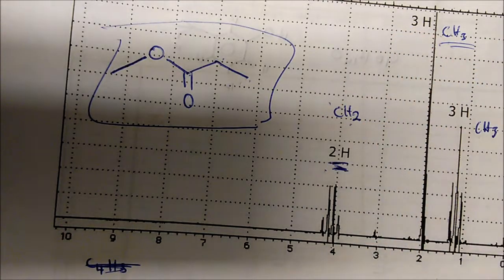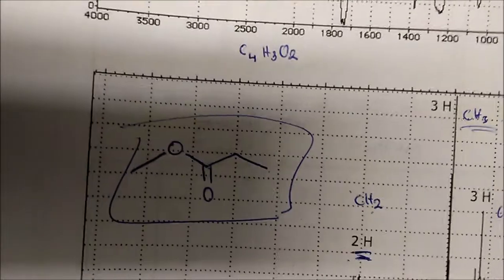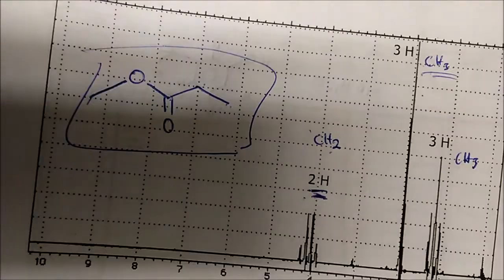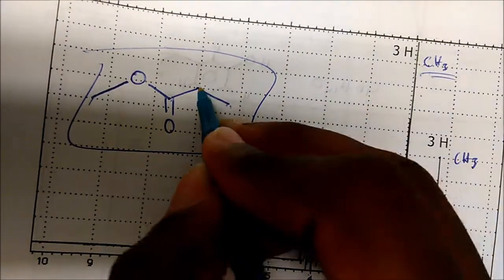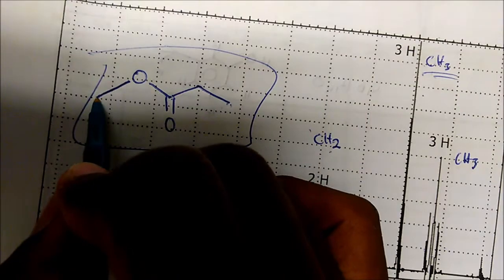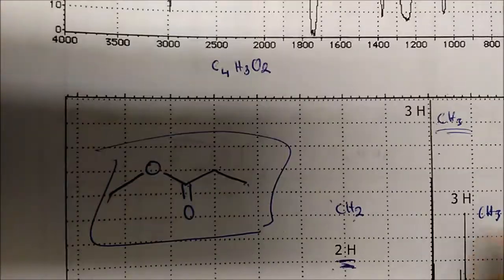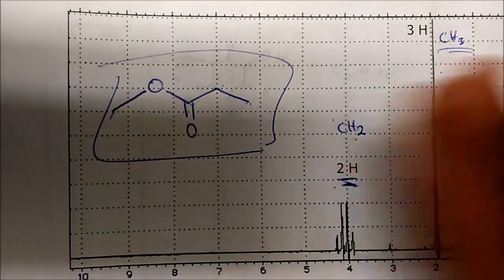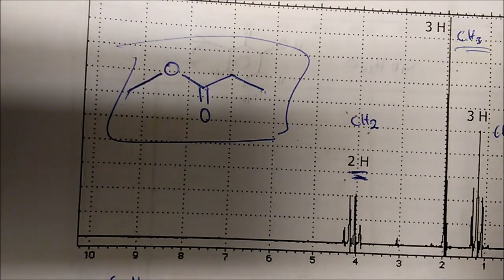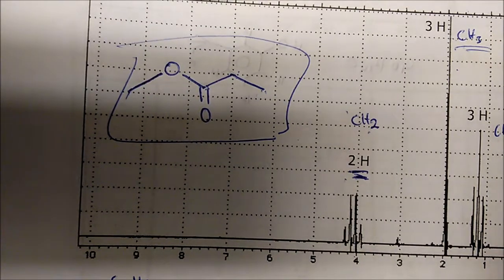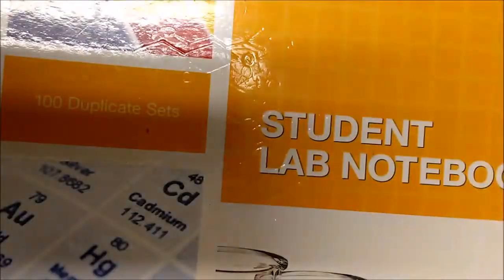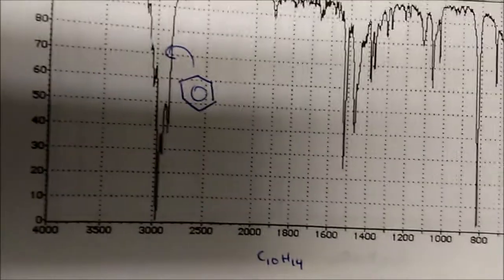And actually, let's go ahead and check a couple of things. Let's see how many carbons we have - one, two, three, four. How many hydrogens? We have three here, two here, that's five. We have zero here, three here. So five plus three is eight hydrogens, and we have two oxygens. So this is a great way of identifying this formula. This would be the molecular formula for this molecule.